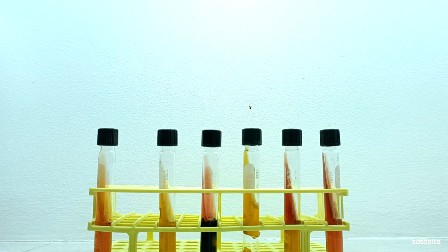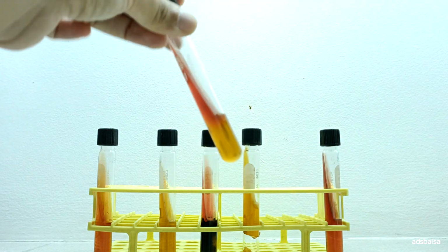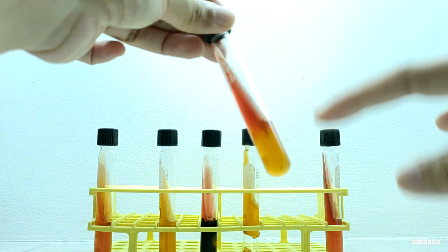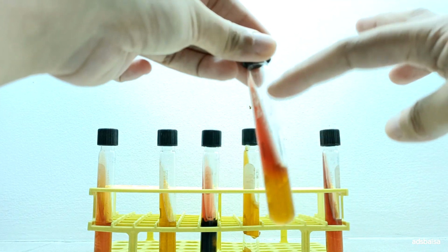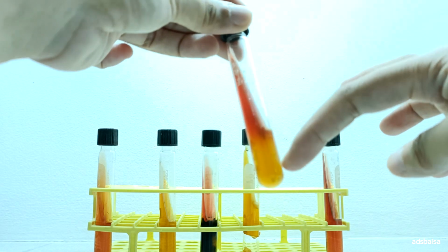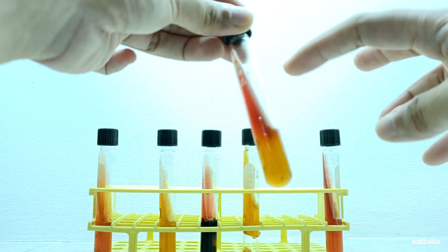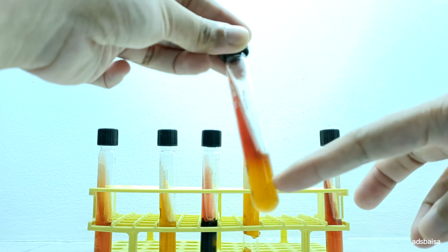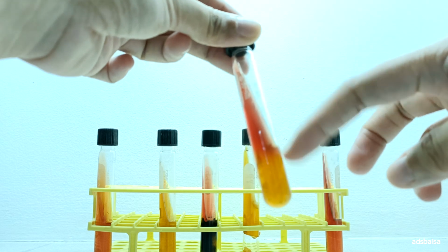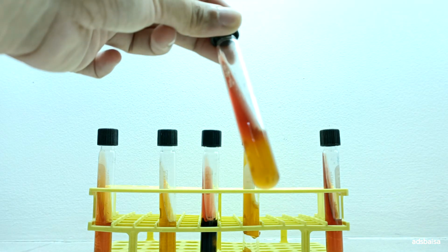So first we have the K over A. So this one is K over A. The numerator represents the slant part, while the denominator represents the butt part. K is for alkaline and A is for acid. Remember, the pH indicator phenol red turns yellow when there is acid production.